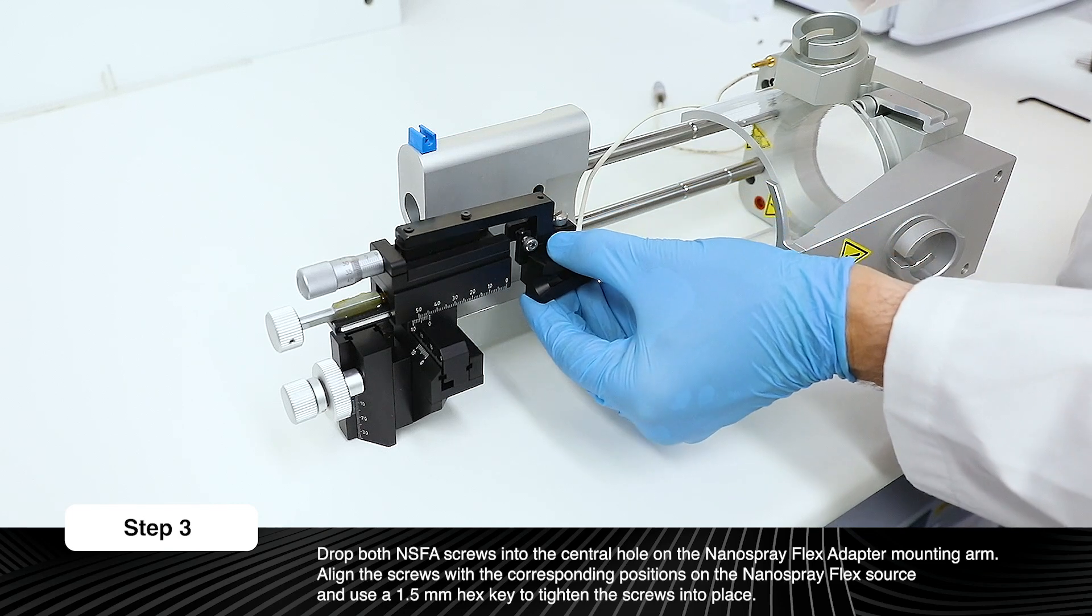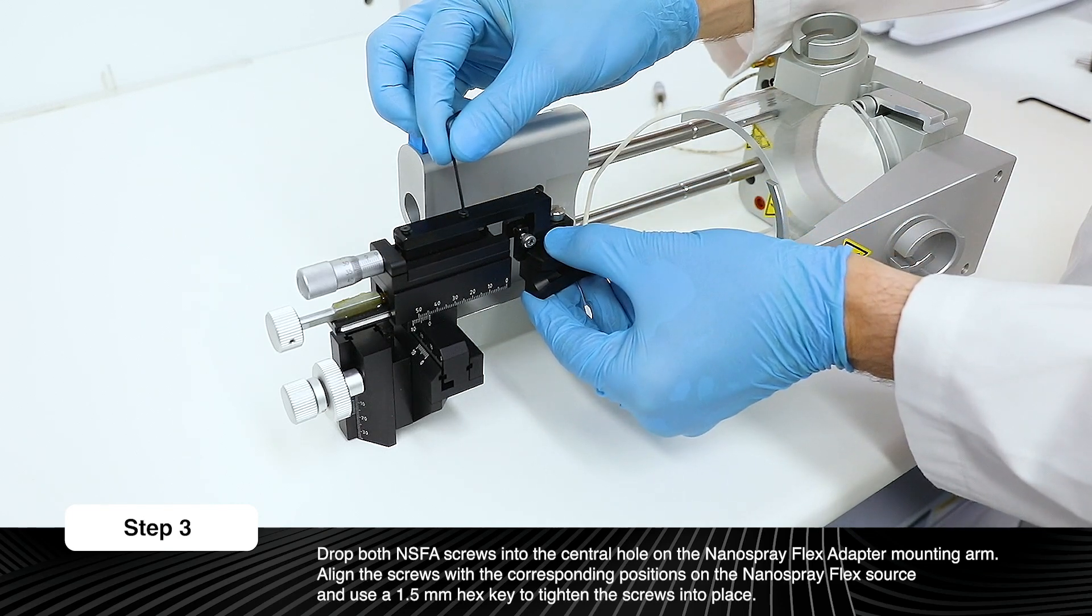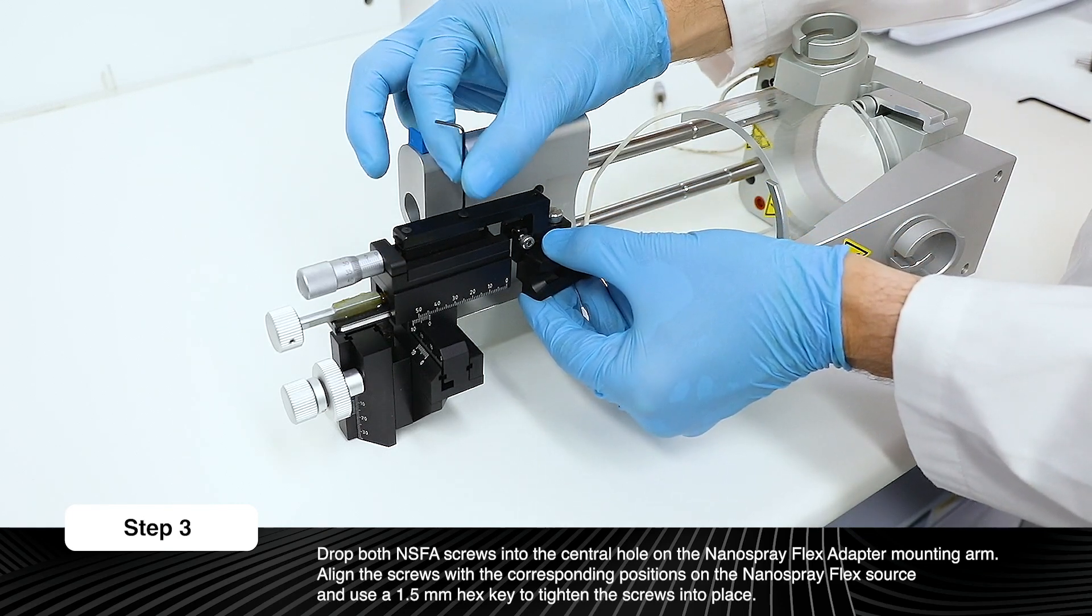Using gravity to hold the screws in place, drop both screws into the central holes of the Nanospray Flex Adapter mounting arm.